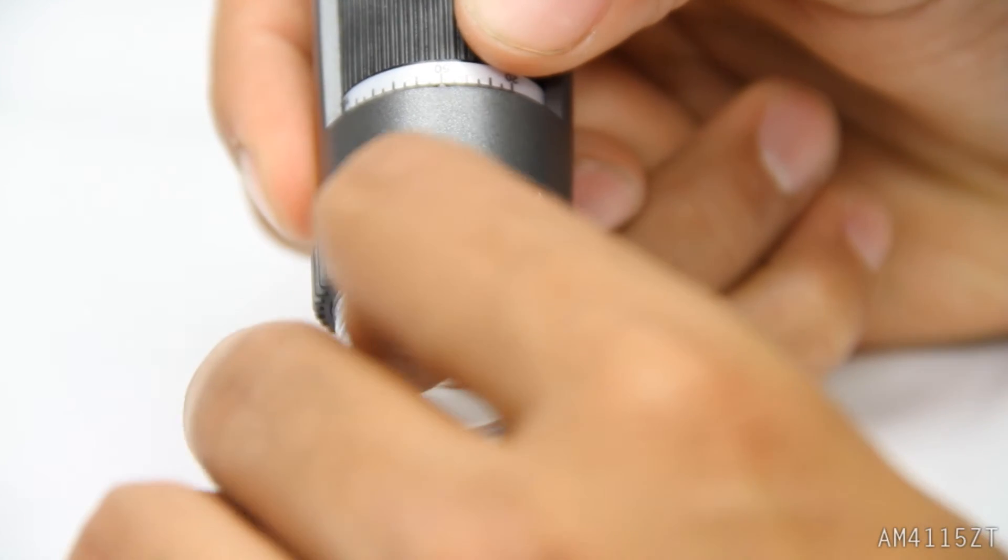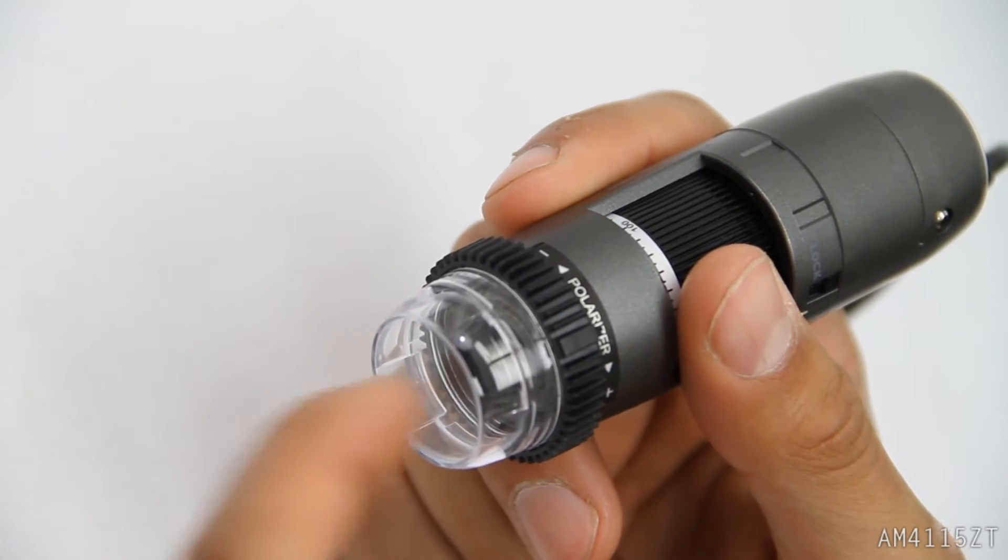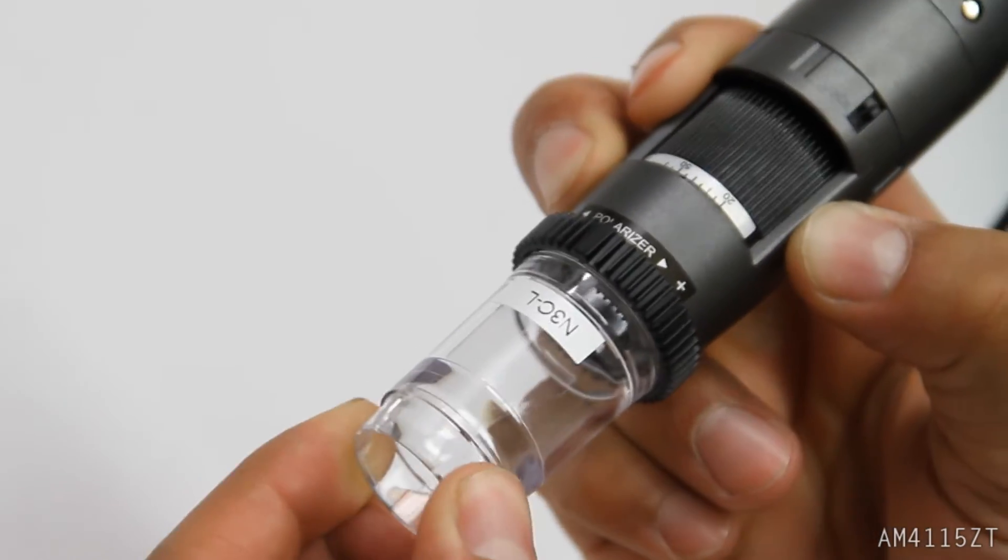The interchangeable cap design allows users to remove a cap for extra working distance or replace it with other useful caps, including a sealed cap, diffuser cap, or extended cap.